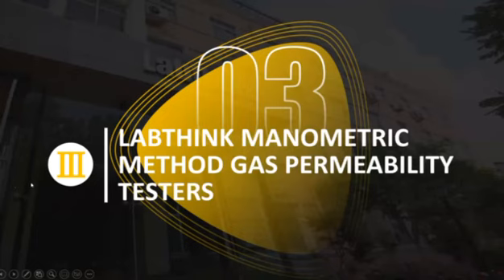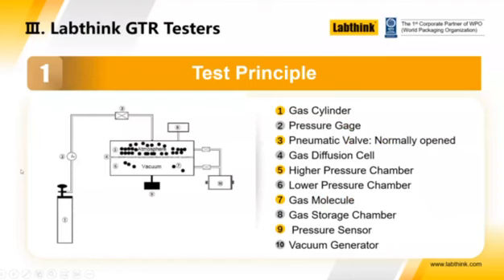So in part 3, I'm going to take a very, very brief look at some of the different equipment that we produce that can help you with this method. Let's look at the test principle first. I did mention how this works earlier on, but you can see here the schematic of the equipment.